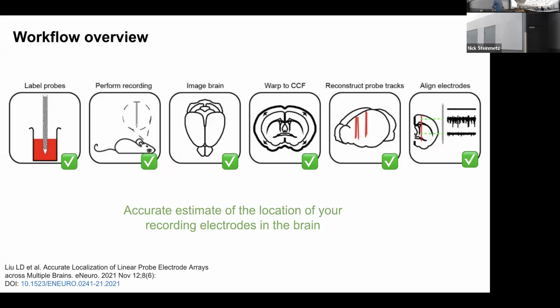So the question is, what kind of quantitative checks can you do to make sure that your nonlinear registration step from your imaging to the atlas space didn't incorrectly distort your probe locations? Does that make sense, Maya? Distort your probe locations.